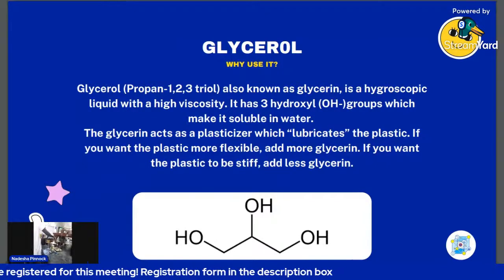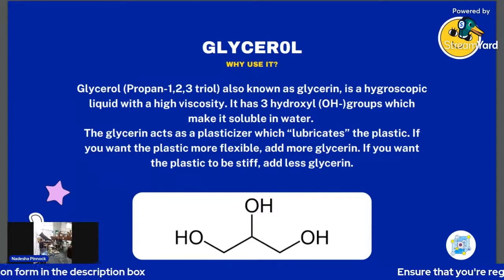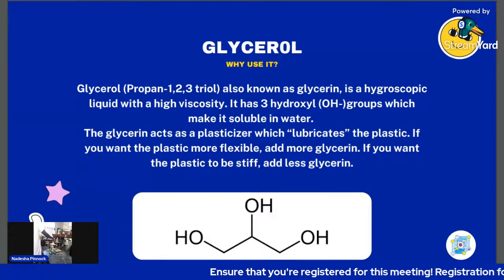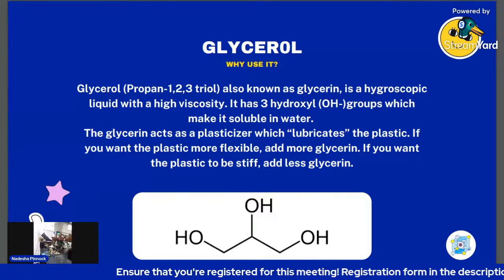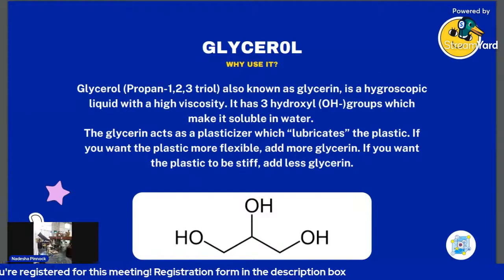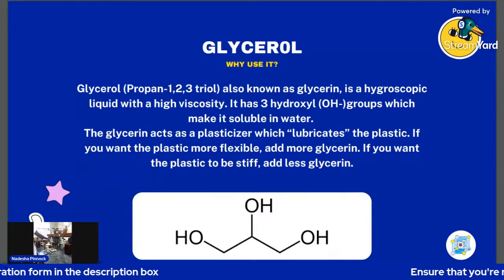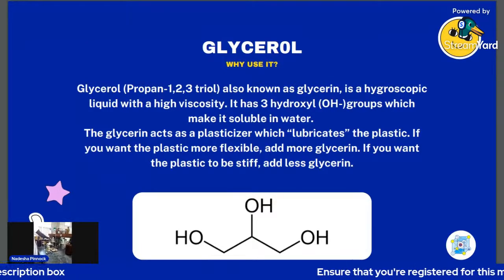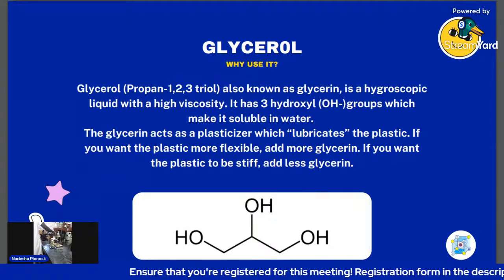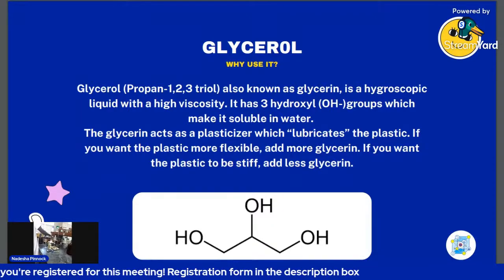The glycerin acts as a plasticizer, so it lubricates the plastic, so to say. So if you want more flexible plastic, you add more glycerin. So I'm going to assume that the plastic that we're getting today is going to be very flexible because we added about 7.5 mils of glycerol rather than 5 mils. So if you want the plastic to be stiff, then you add less glycerin, right? If you want like a hard plastic.